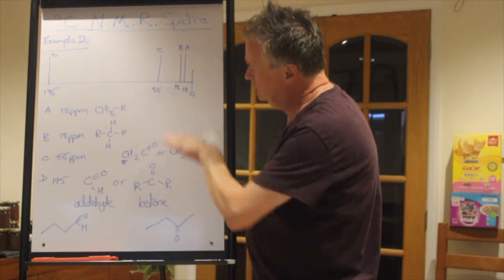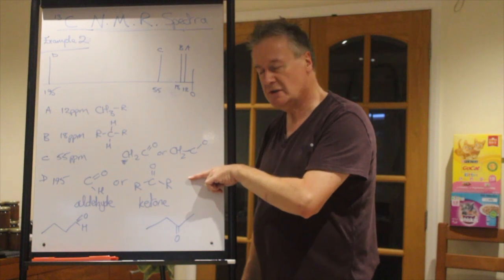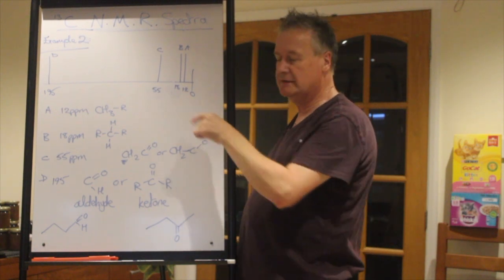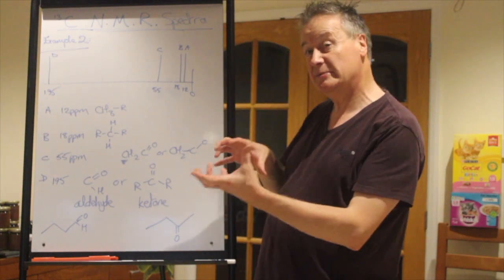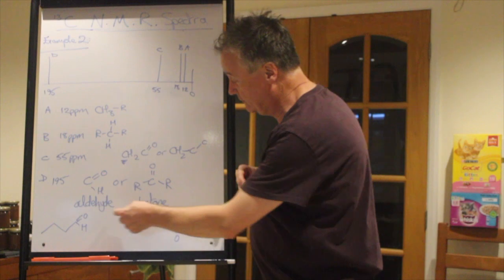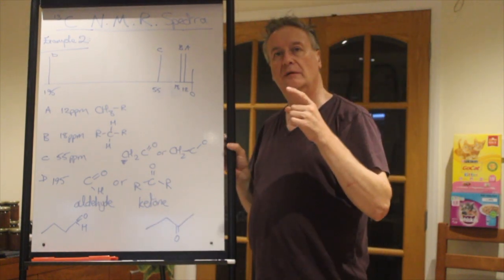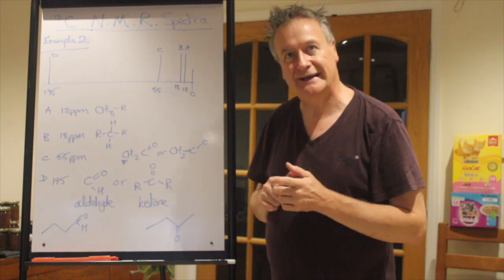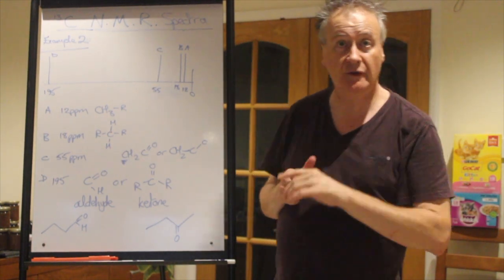And so taking you through the analysis, you end up with, this is the type of compound, here's the breakdown of the carbon chain, not enough information. What really would happen is if you put that with a proton NMR, you will be able to tell which one of these 2 it was fairly straightforwardly. But we're not doing that yet. So that's example 2. We've got one more example to go.